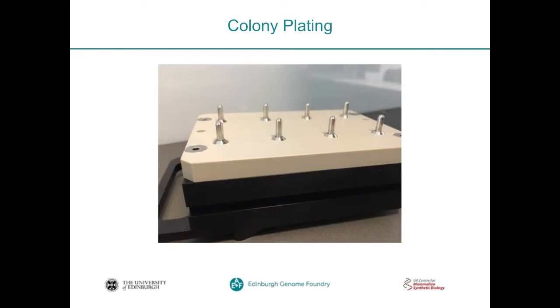And to show you how this works, we have a short movie, which I'm going to show you now, and that explains the whole process of plating.